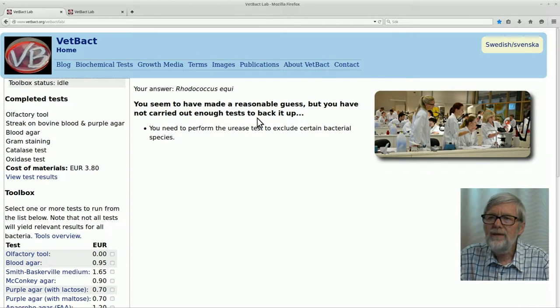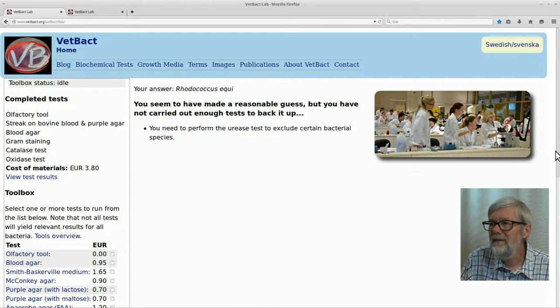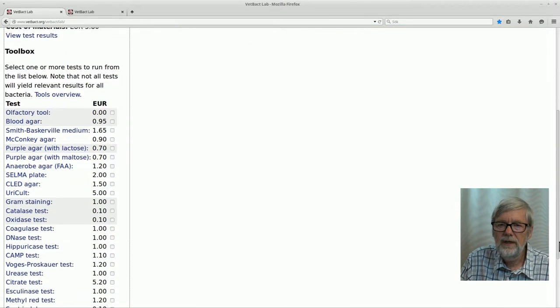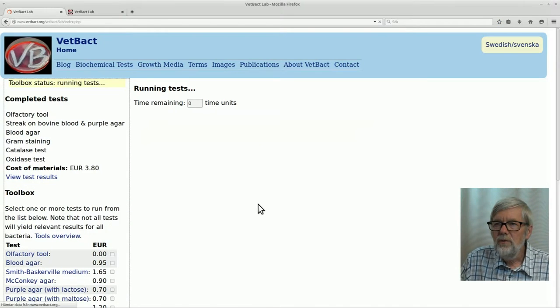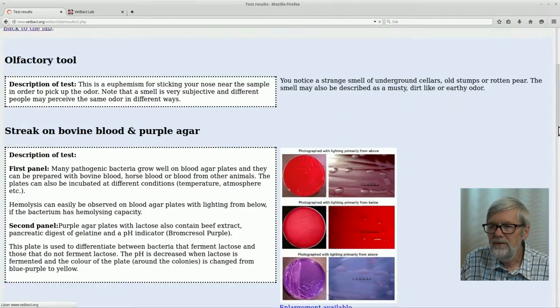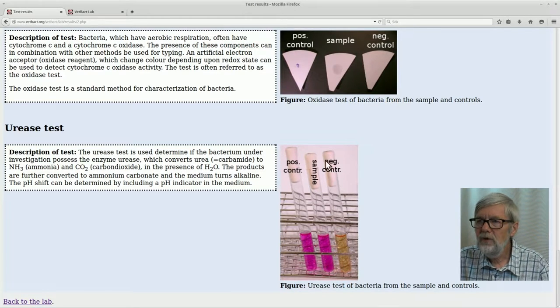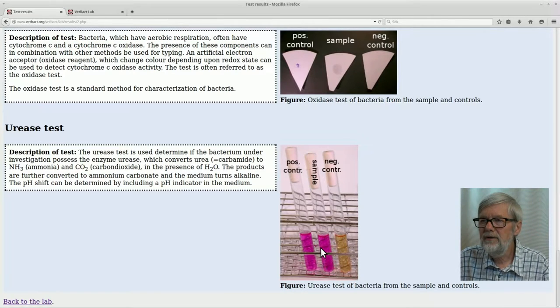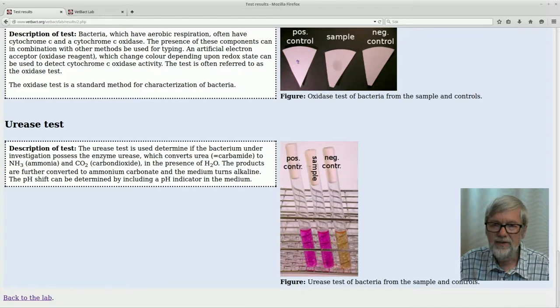Here we get some feedback. It's a reasonable guess, but there are some additional tests that have to be done also. For instance, you should perform the urease test. Let's scroll down to the different tests, select the urease test, and run it. We have to wait a little, then we can view the results. Here you can see a negative control, a positive control, and your sample — it is urease positive, and that confirms the identification as Rhodococcus equi.